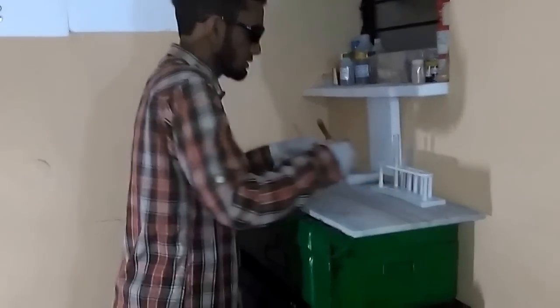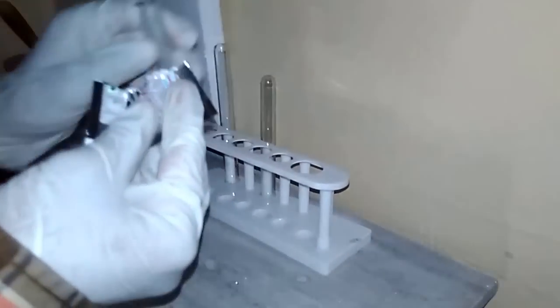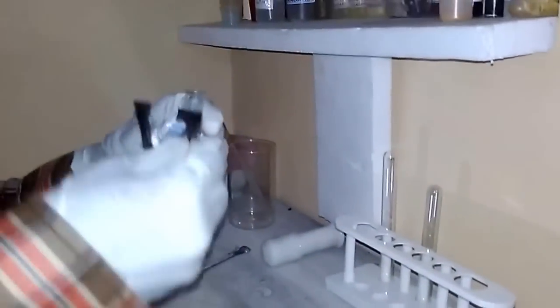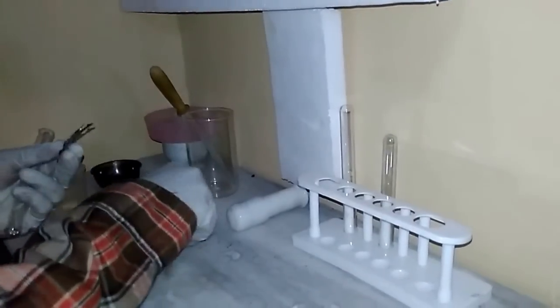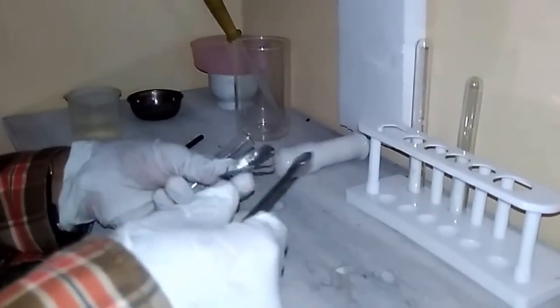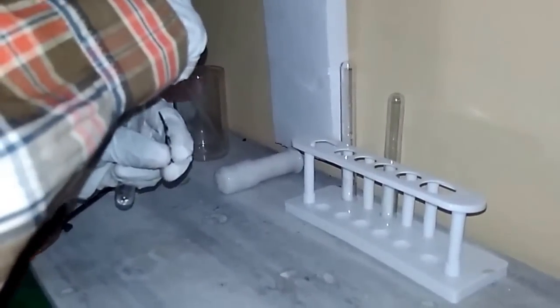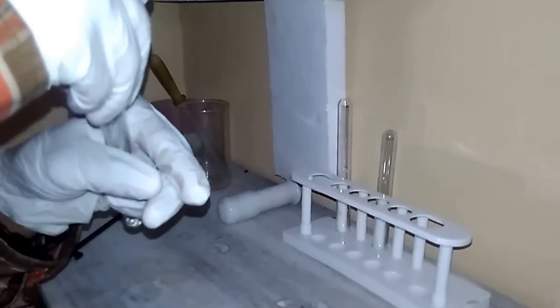So I will be doing this test to find out whether this product really has silver or not. This product has a very good smell — it is rather a mouth freshener. You can see that there are some silver-colored balls here down in the test tube. We don't know whether this has silver or not, but I will check it out.